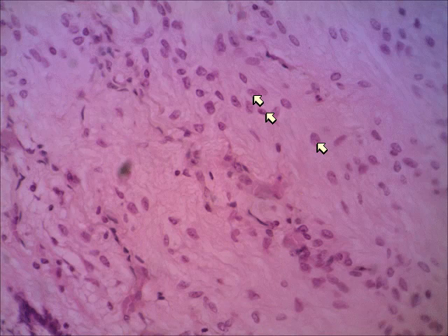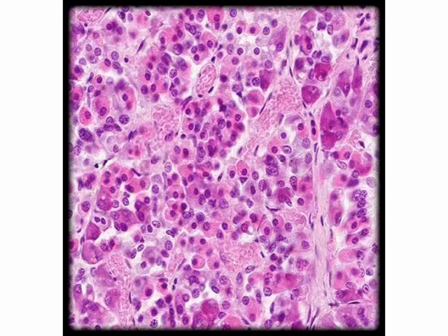All right, but if I give you a high-power magnification, such as this one, I'll probably say which lobe of the pituitary. So you'll know you're looking at pituitary, but you just need to know which lobe it is. Now, you tell me, if you're looking at the pituitary on this slide, would you be looking at the anterior lobe or the posterior lobe? Okay, if you said anterior, you're correct. And the reason is because you see distinct cells, and you see cells arranged in little clusters. I call those secretory clusters. You see that in lots and lots of glands of the body.